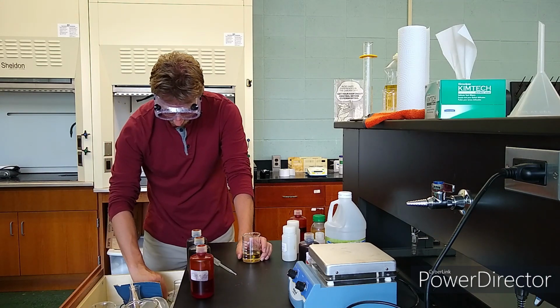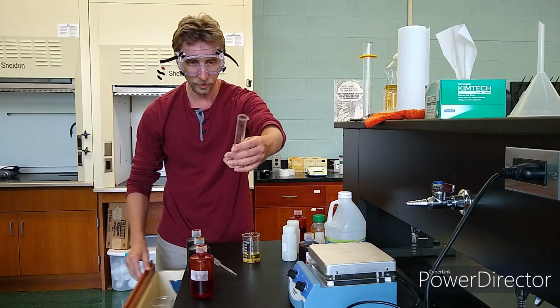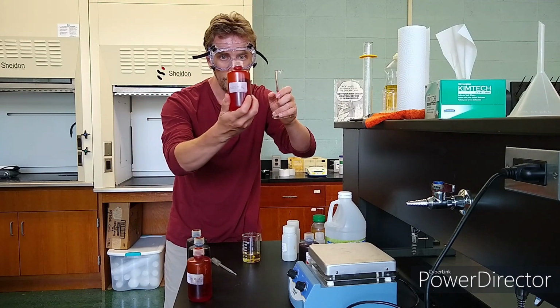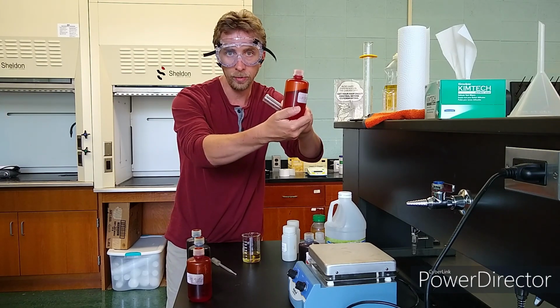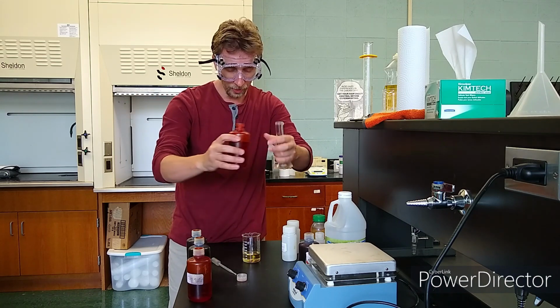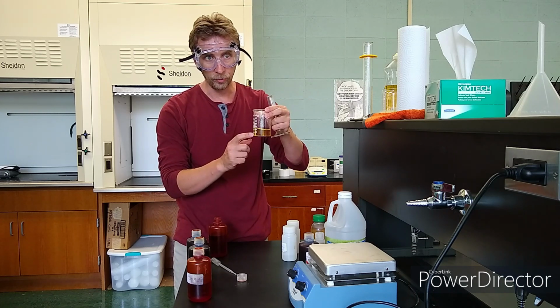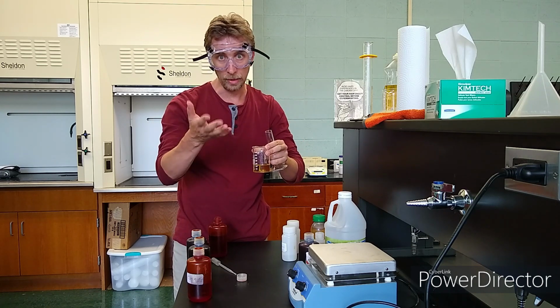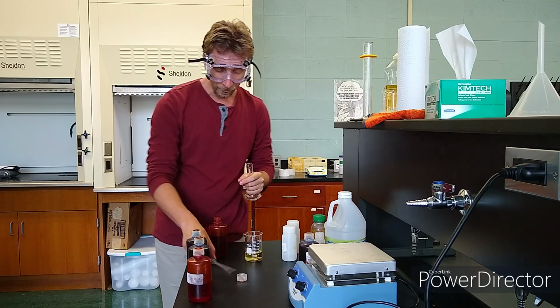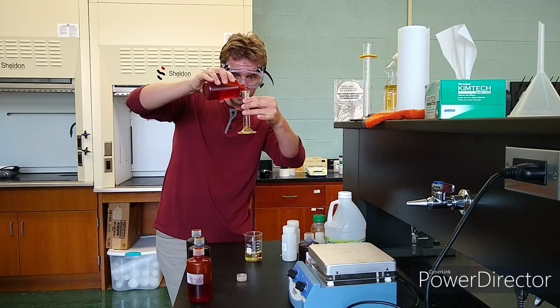Now for this check, it's going to be semi-quantitative. I got a 25 milliliter graduated cylinder here. I think I'm going to use this bottle of iodine, since this one is full, about 200 milliliters of iodine. I'm just going to see if it's good. If it's good, then it'll take a lot of this iodine to react with all the ascorbic acid in the juice. I'm going to explain that in more detail in the classroom on the board. But I'm going to first start with 10 milliliters of the iodine.